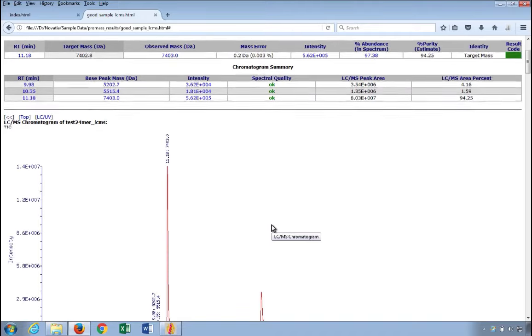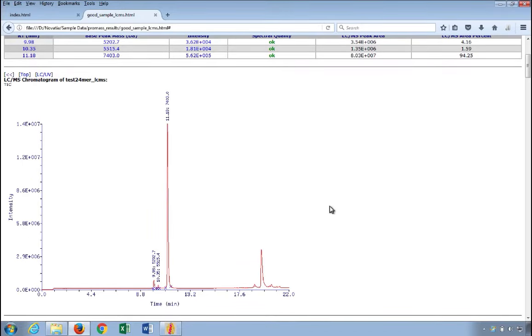If you scroll down a bit from the summaries, you'll start to see the actual data. Each figure in the following sections has a bolded label at the top so you know what it is you're looking at. In some cases, you'll also see a subheading with some extra information, like the UV collection wavelength. You'll also see a spectrum in the middle, with units and numerical labels on each axis.